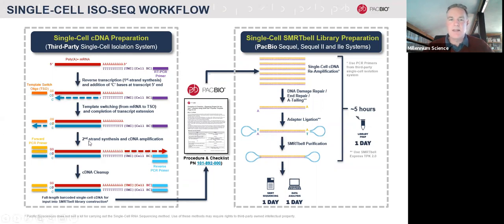But built into this method, if you're working with one of the single cell systems, is that this poly dT primer contains some special sequences: a cell barcode, and potentially a unique molecular identifier, which allows the mathematics to go on in the analysis pipeline. It allows you to count the number of transcripts that you get per cell to work out the gene expression levels. So this is included within the primer, just that little bit of extra magic, effectively, to make the cDNA with this detail from a single cell.